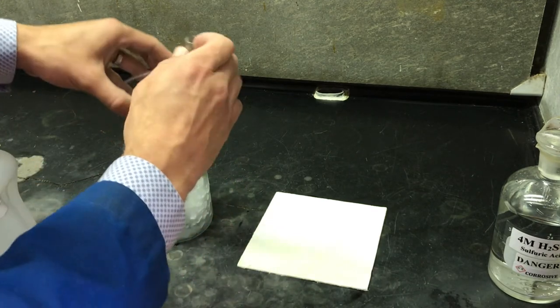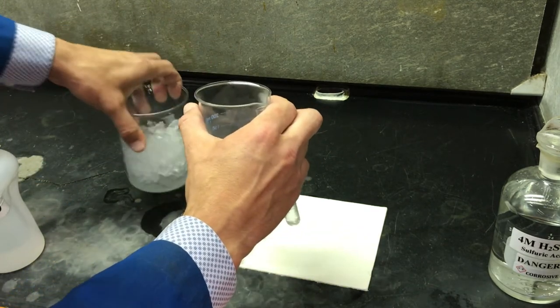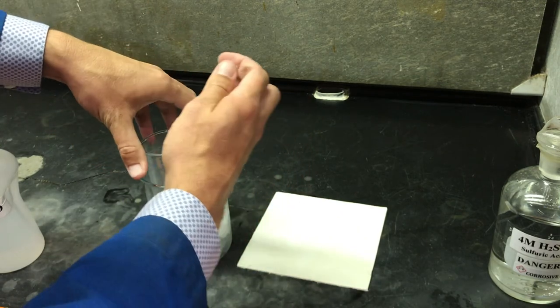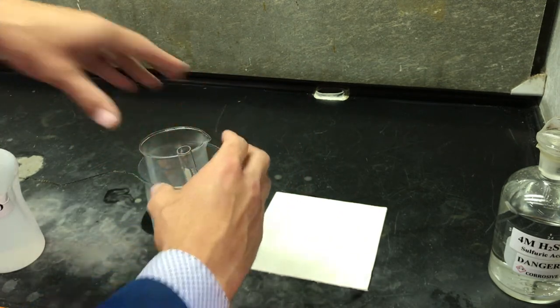As the reaction beaker cools, the solubility of our potassium alum decreases until it crystallizes out of solution in an isolated solid, which we can filter.